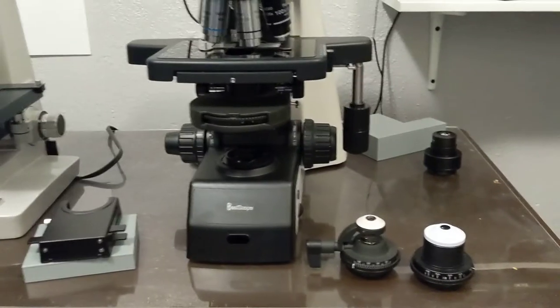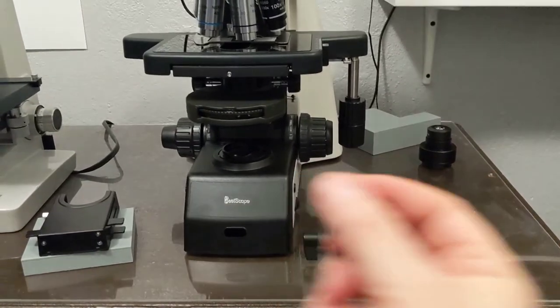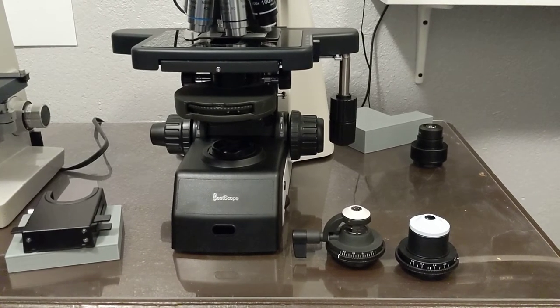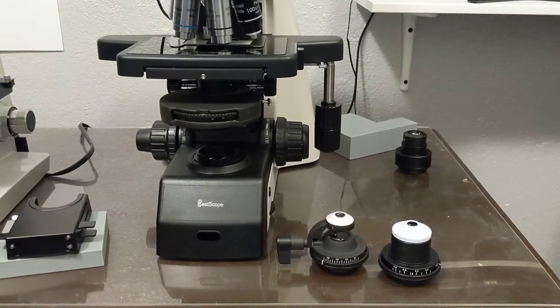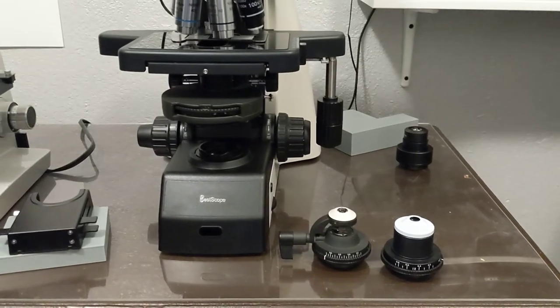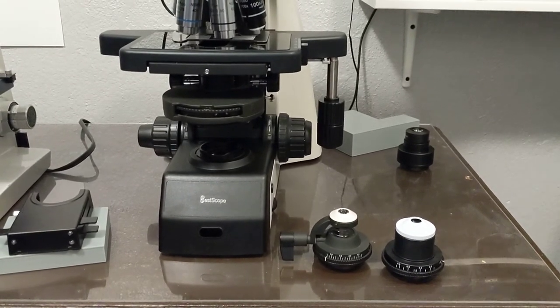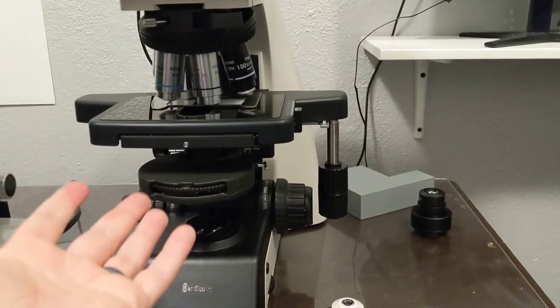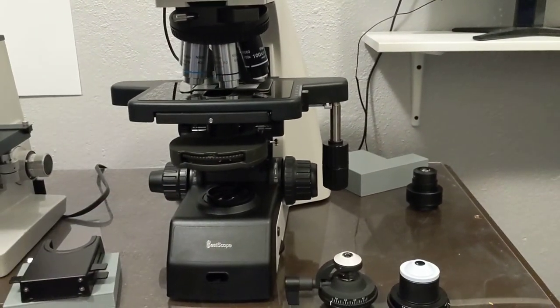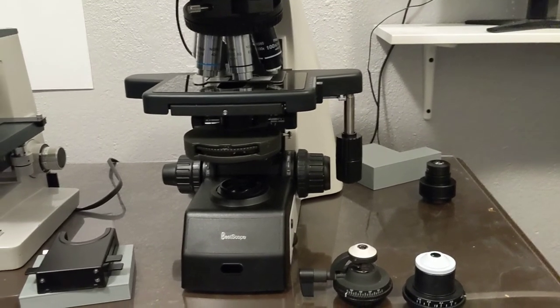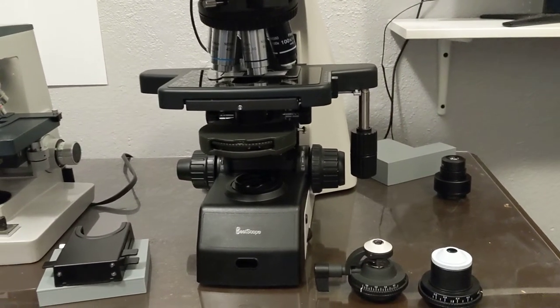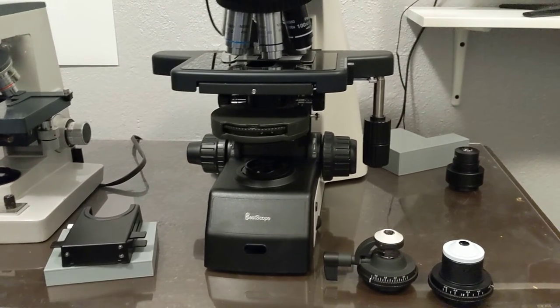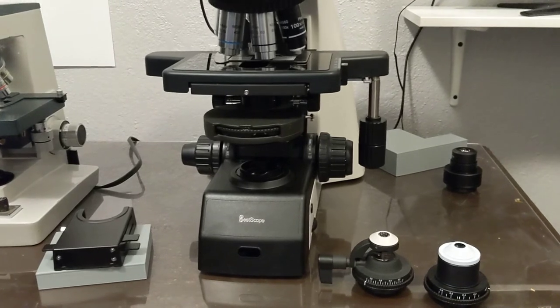That's a little bit of a downside buying from this particular company. They put together parts from probably a few manufacturers. There are some things that they just don't have. They don't have high-performance condensers. The phase contrast condenser has a little spring that prevents the condenser aperture from being used unless you're looking through the bright field spot. The DIC condenser had that same spring in place. I went in there, unscrewed it, opened it up, and disabled the spring. Now I am able to use that.